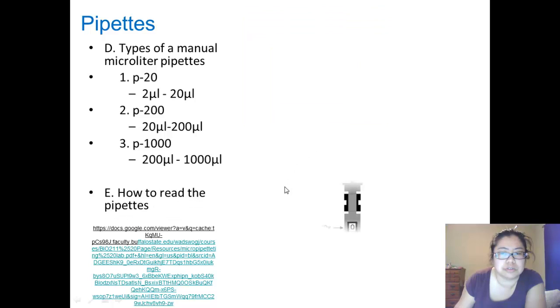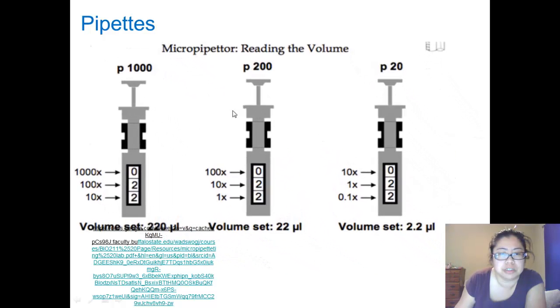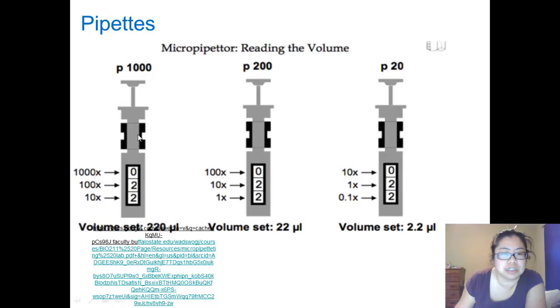So how do you read pipettes? Over here we have an example. Here is the 1,000 microliters capacity. The first digit is going to be the 1,000s place, then 100s, and then the tens place. So remember it goes from 200 to 1,000.